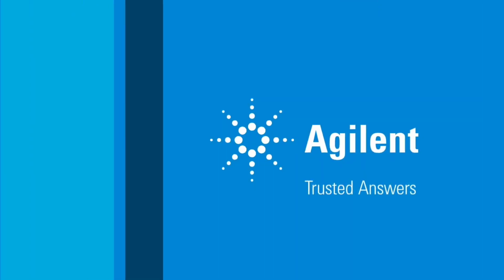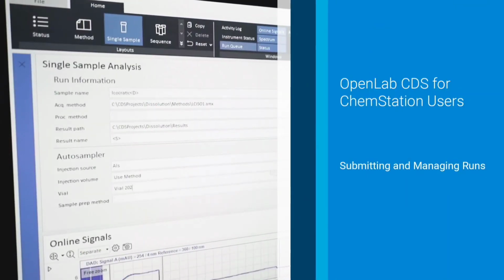Hi, Josh here with the Software and Informatics team at Agilent. In this video, we'll take a brief look at submitting and managing runs in OpenLab CDS.